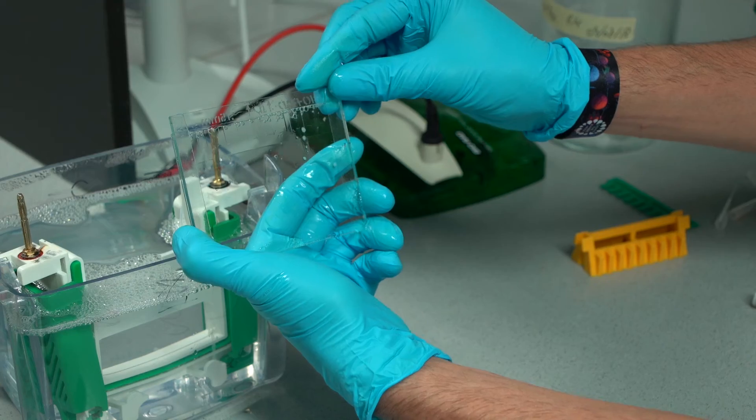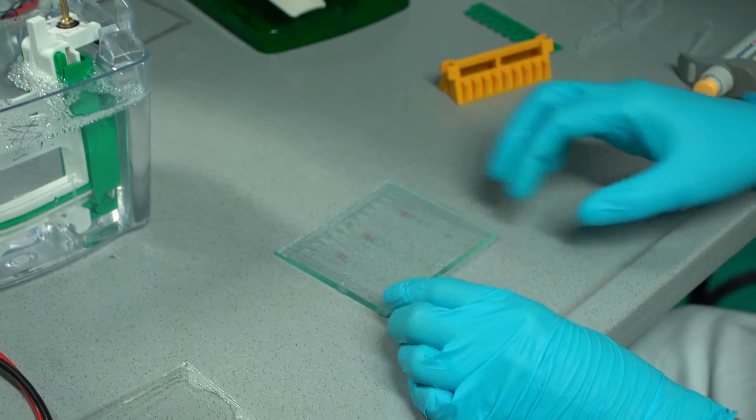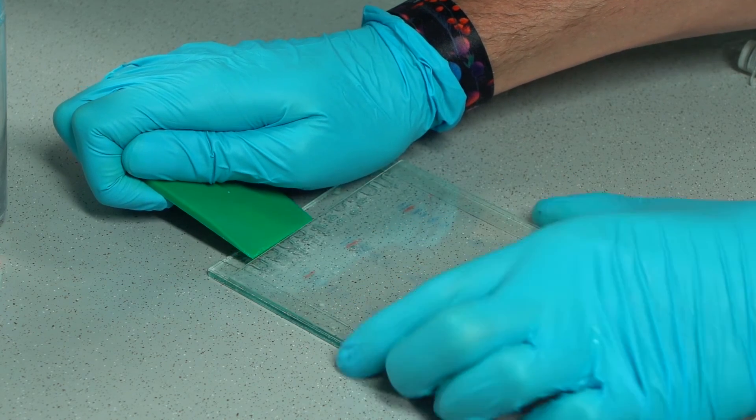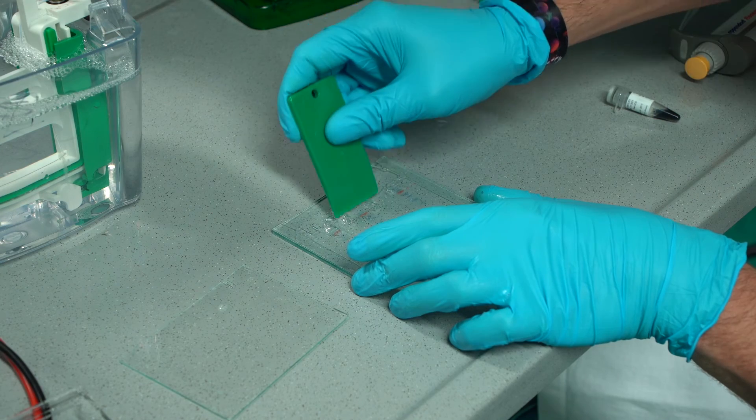To detach the slides, the easiest way to do this is to place the glass plates with the spacer plate on the table. With the green cutting aid, you can carefully raise and release the short plate. Cut the stacking gel away from the running gel using the green cutting aid.